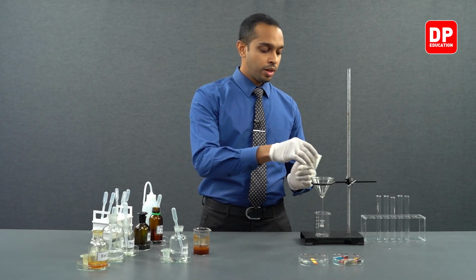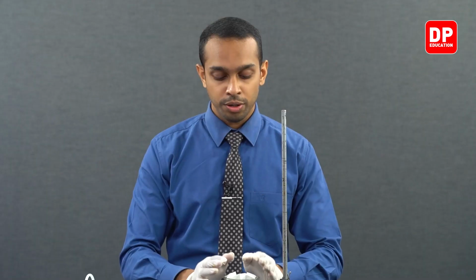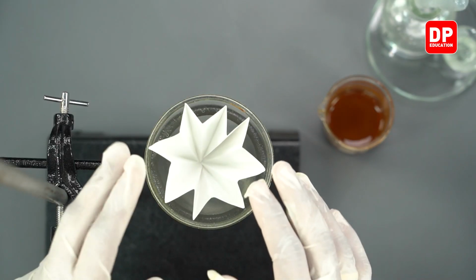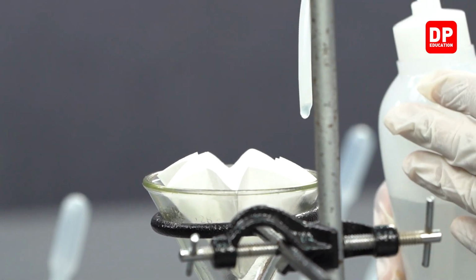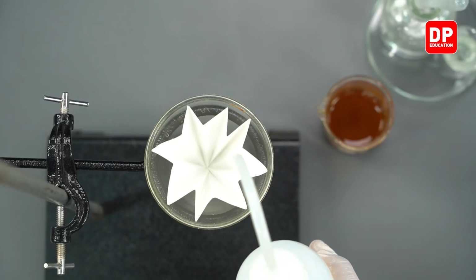So, now I will place this filter paper on top of our funnel, and after placing our filter paper on the funnel, we can wet the filter paper with a little bit of distilled water.